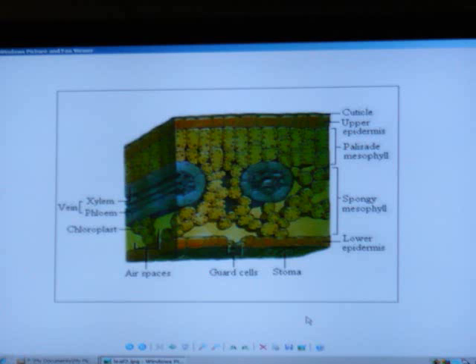I might have a line drawn there. What is that? There's nothing there. It's an airspace, and you find airspaces always on the bottom. All right.